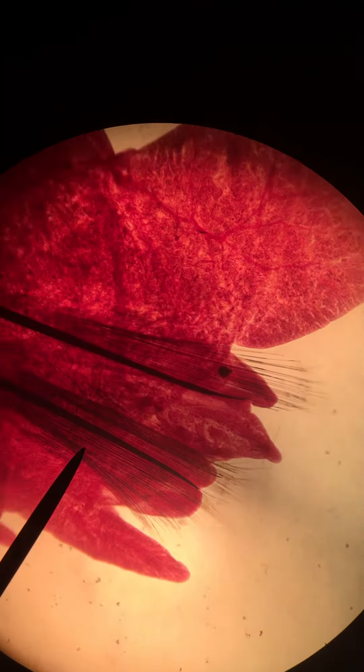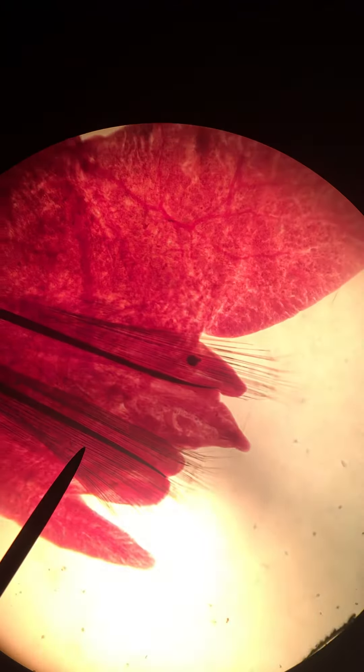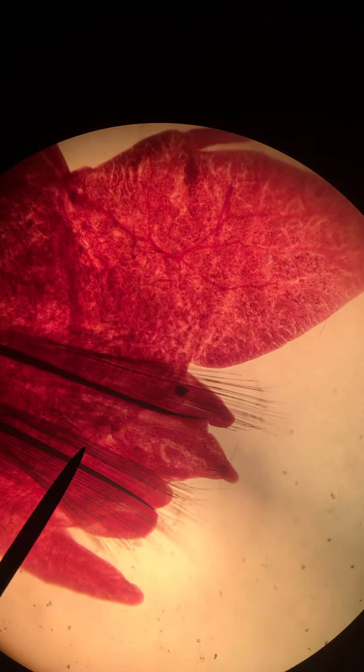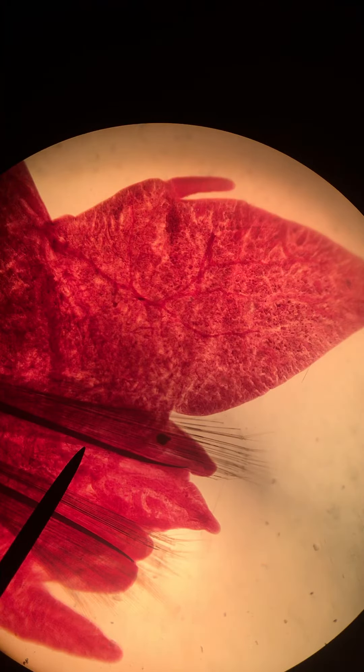It's showing you that there is an appendage that has been taken off of our worm. There would be a parapodium on each side, left and right, of each body segment of the worm.